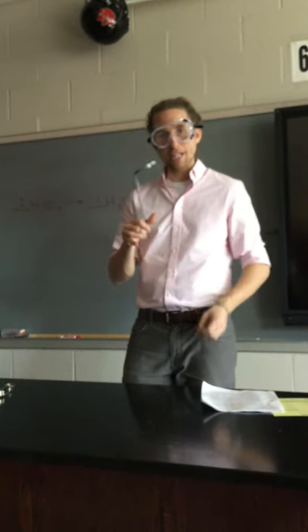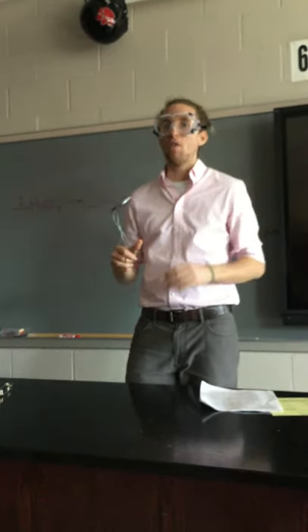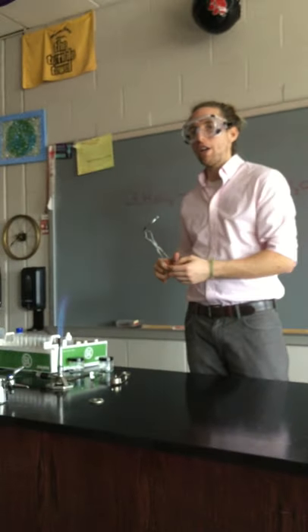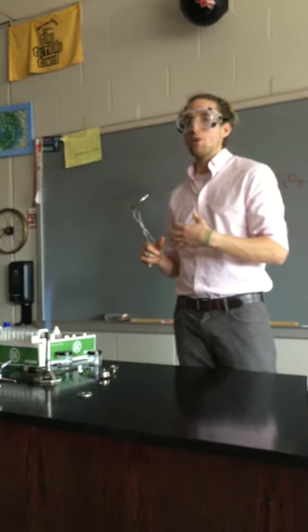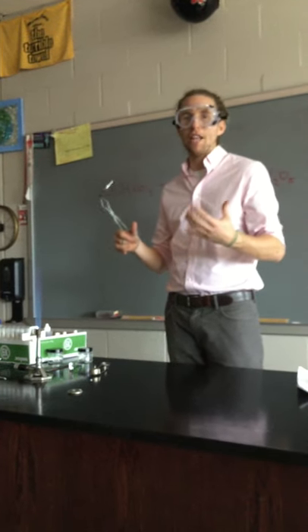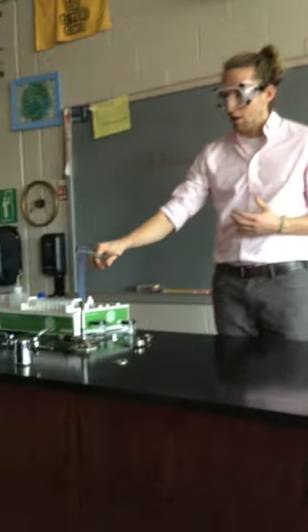We're going to start reaction 1 with magnesium and the oxygen in the air around us. Now it's important that once I get this thing lit up from the Bunsen burner over here, that you don't look directly at it. So pretend it's like the sun. You can look at it out the corner of your eye, but don't just stare at it for the entire time that it's on fire.